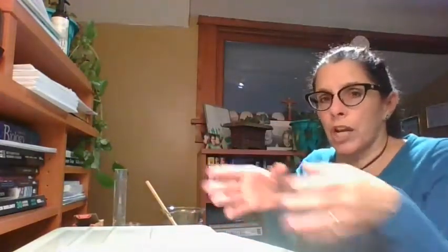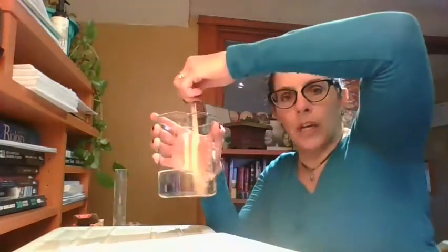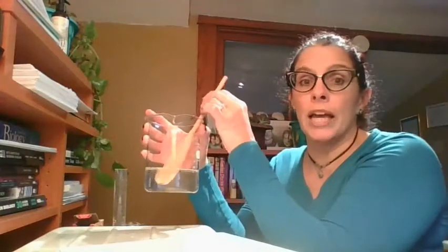I'm going to go over how every single variable starts out, because you're going to pick a variable in just a minute. When you move on to the next slide, all of this will already be done, and you'll just be watching the data collection for that particular variable. The first thing I did is prepare 300 milliliters of bicarbonate solution. That's this right here. Bicarbonate is baking soda, and it puts carbon in there, and that helps the photosynthesis.